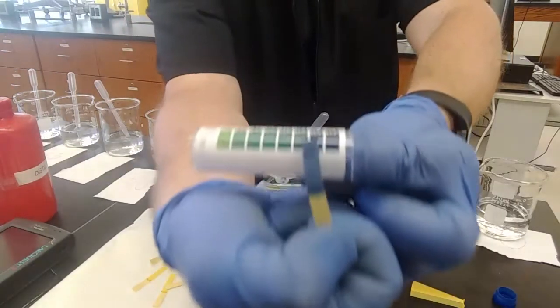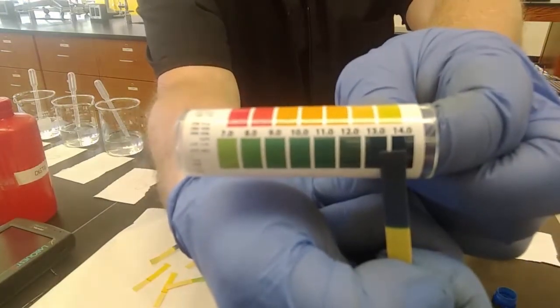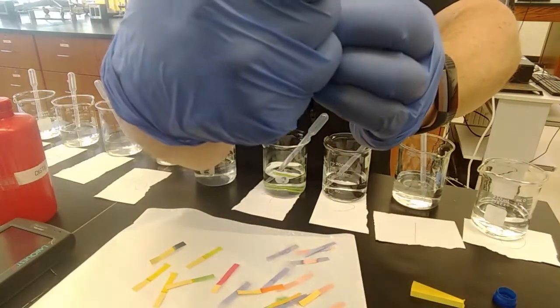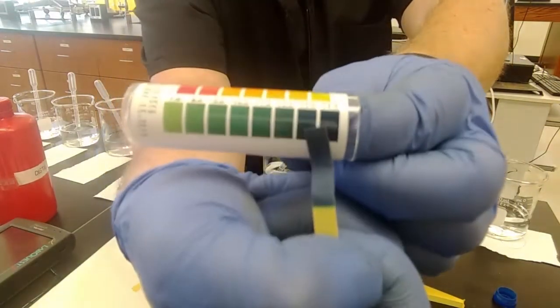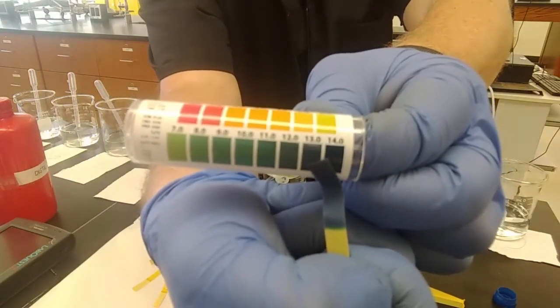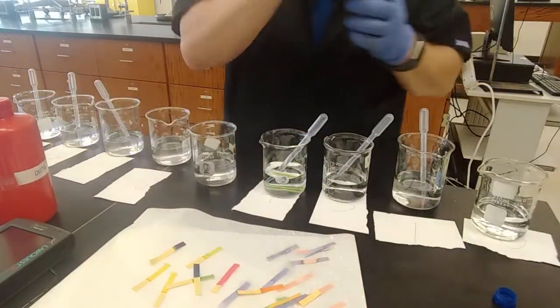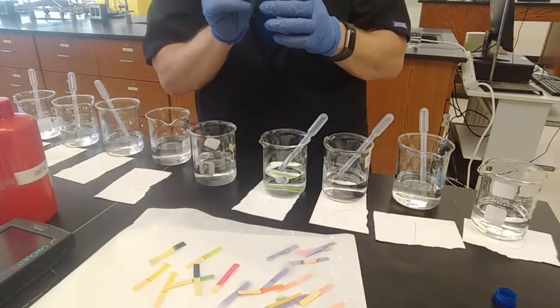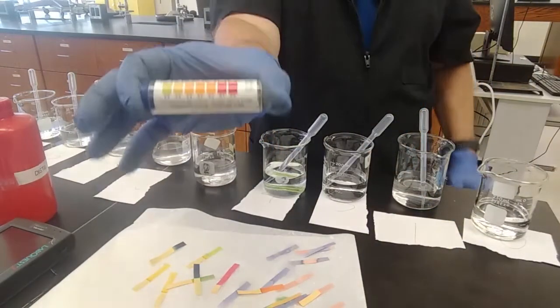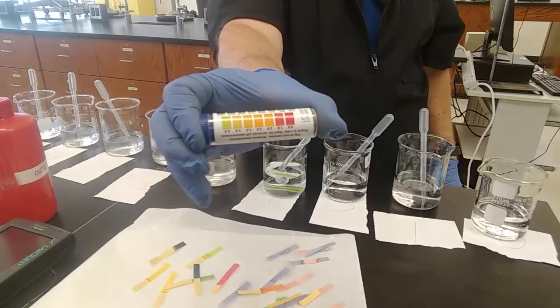I'd go for that. 14. Right? Is it darker than 13? I think so. 13 versus 14. There we go. All right, so that's the universal indicator strip, or strip pH. It says strip pH on the data sheet. Doesn't mean take your clothes off and measure the pH. It means a universal indicator dried onto a strip of paper.